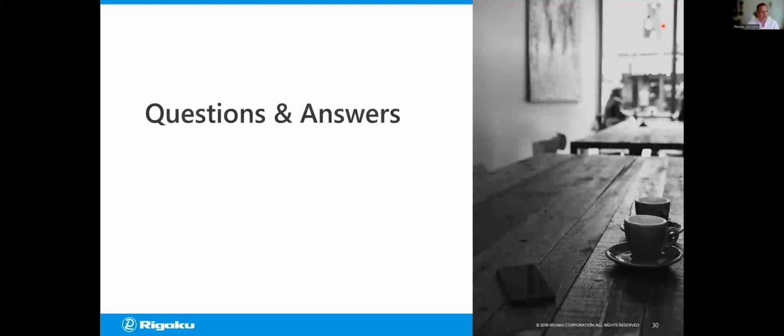And our first one, Simon, is from Bo. It says, how do you do the ALS MCR analysis? And do you have a recommended software package? Yeah, the package that I would normally use is the one that's in the R statistical environment. I like to use R again. It's a freely available package. Anyone can access it. It's independent of what X-ray system you're on, whether you're on a synchrotron or wherever.